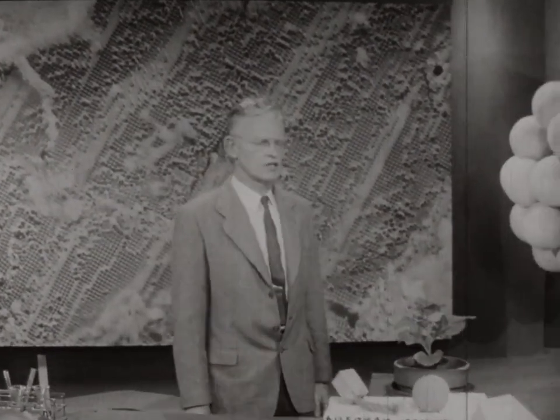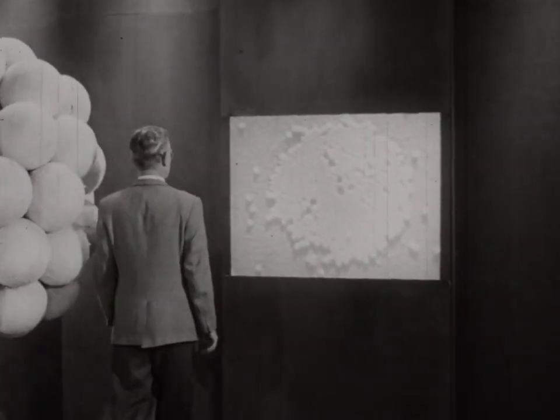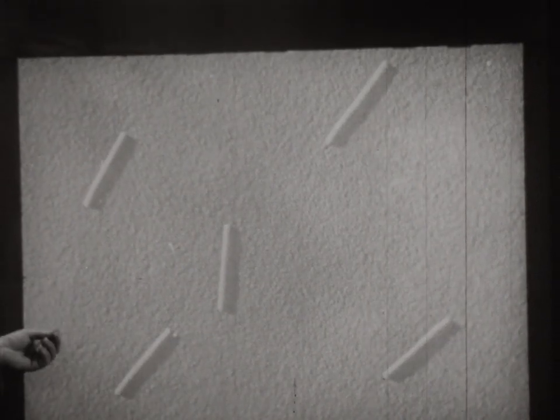Now, if we actually want to take a look at what the viruses look like, so to speak, in real life, we insert them in the electron microscope, and when we do this using poliovirus, we find that there is an exceptional degree of uniformity of size and shape of these viruses such that they actually crystallize. Now, we can also try another virus. For example, let's take a look at tobacco mosaic virus. Here we have the typical rod-shaped forms, but once again, a high degree of uniformity of shapes and sizes.